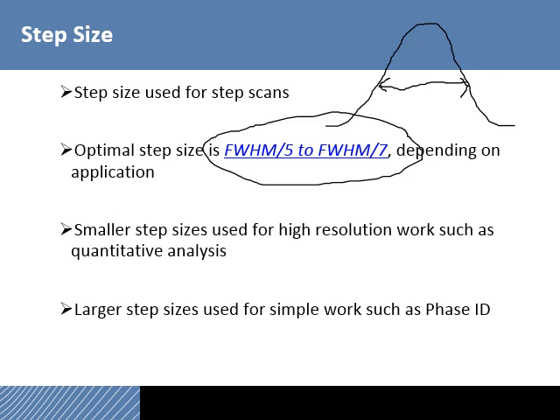And in general, you want at least 5 or 6 data points in the upper full width half maximum of your peak, so that your peak, for lack of a better scientific term, looks peaky, right? If you have too few data points, you won't necessarily hit the real peak summit, or the real peak position. So you want to have enough data points that you can actually define that peak shape. Optimally, you would like to have 5 or 6 data points in your full width half max. I drew 5 in there, but you get the idea.